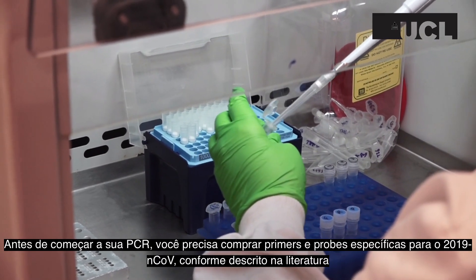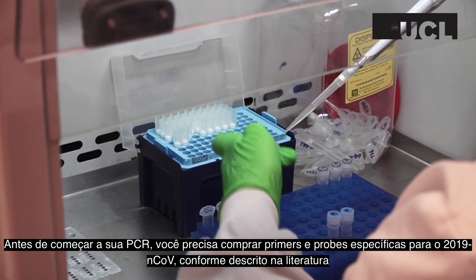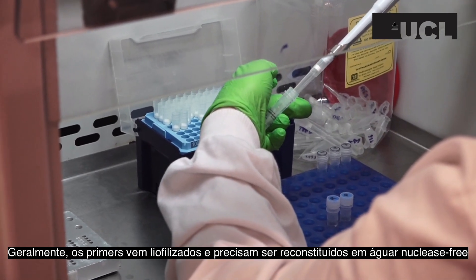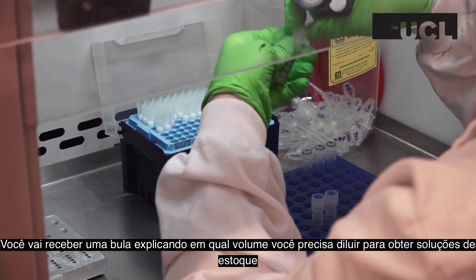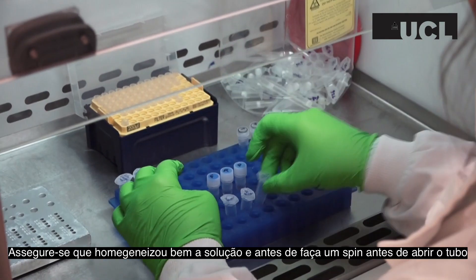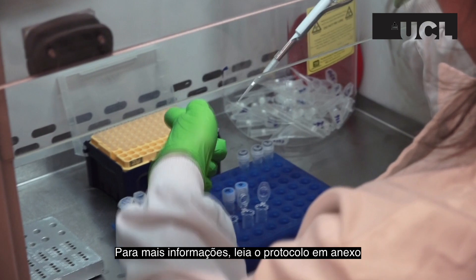Before starting your PCR, you will need to order primers and probes specific to the 2019 nCoV as described in the literature. Usually, primers will be delivered as a lyophilized powder and will need to be reconstituted in nuclease-free water. You should receive a data sheet with your primers telling you what volumes are needed to make stock solutions. Ensure you have thoroughly mixed the water with the powder, and before opening your tube, spin it down in a centrifuge. For more information about fluorescent probes, please refer to the accompanying PDF protocol.